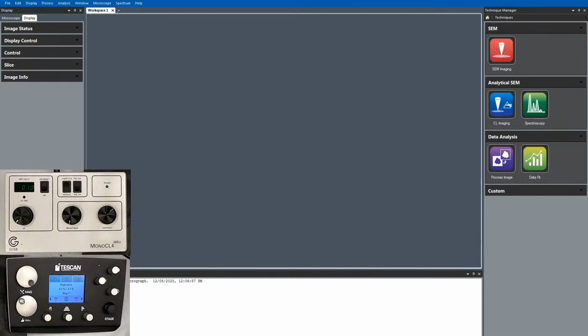Okay. So hopefully now you can see here, this top hand panel is on the desktop. It's a photomultiplier controller and has a brightness and contrast knob. The very first step is we want to turn on the photomultiplier. So we just switch that to on, and then you'll see a voltage here that, as I turn the knob clockwise, that voltage goes up.